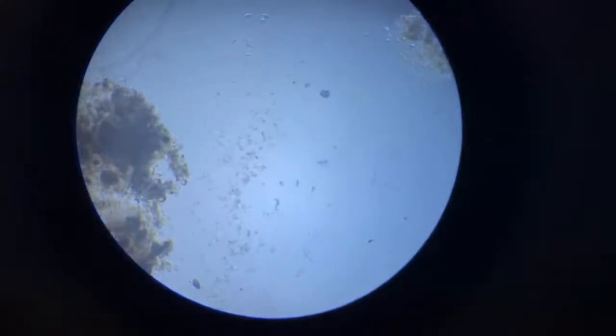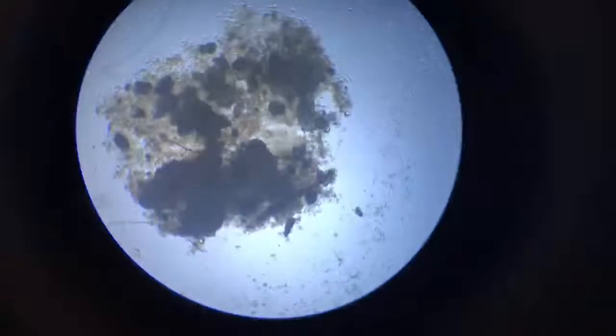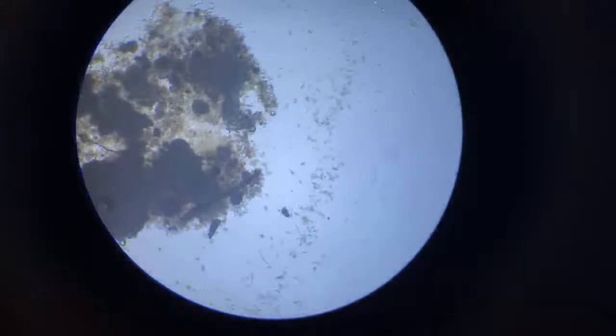Right. So we will now put our slide on the microscope, first under low magnification, and see if we find something. Of course, that whitish thing, and we can already see a lot of ciliates around. We still have to zoom in.